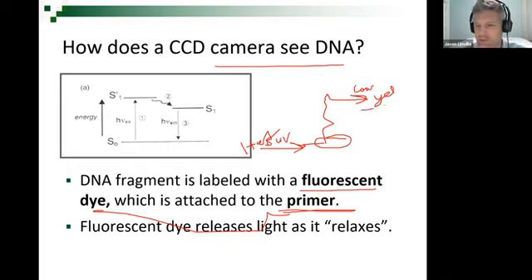But anyhow, what made me think of that exam was everybody did pretty well when talking about the orange goggles, yellow goggles blocking that blue light. So here, the fluorescent dyes that we're using, we actually order. They're special fluorescent dye molecules, so it's not just like labeling them with a semen stain. But they work the same way, where high energy light goes in, blue or UV. We're dealing up here in the bluish green range, but it's still down on that end of the rainbow.